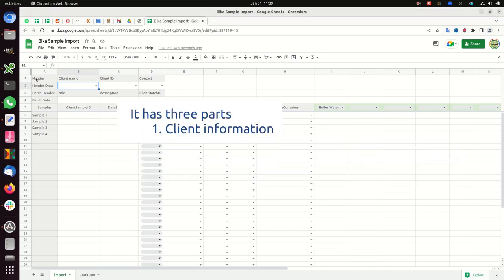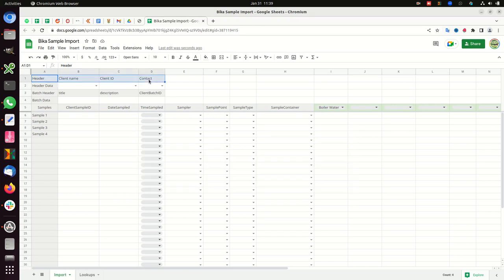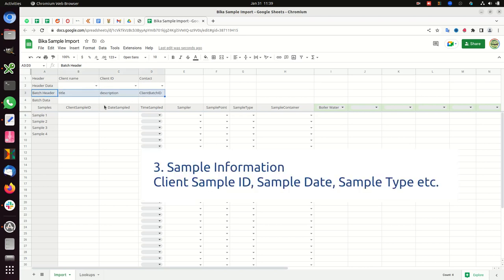It has three parts. One, client information. Two, batch information, either an existing or new batch. The samples will be created there. Three, sample information: client sample ID, sample date, sample type, etc.